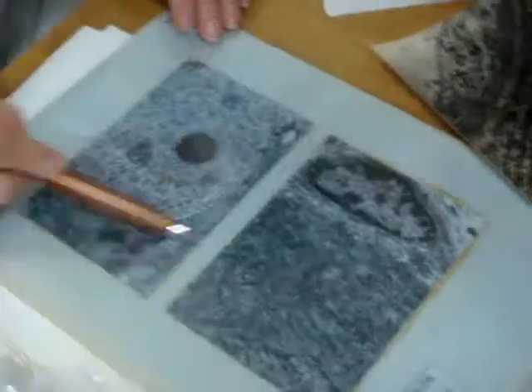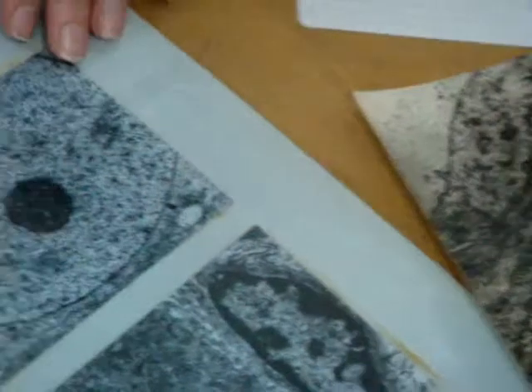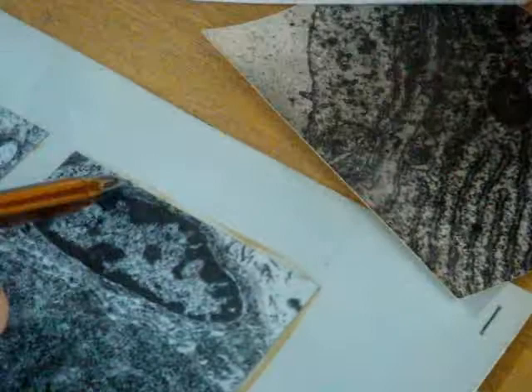Next, here we can see part of one cell, this is the cell membrane, and this cell covers another cell. After that will be the basement membrane. The nucleus is very light. So let's look at the cytoplasm. Small Nissl bodies, very low magnification. These are neurons, and the neurons are covered by satellite cells. This again is a neuroglial relationship. This is a neuron, the nucleus of the neurocyte, this is a very small Nissl body, and this we can see a glial cell, a satellite cell, and only after that we can see the basement membrane.